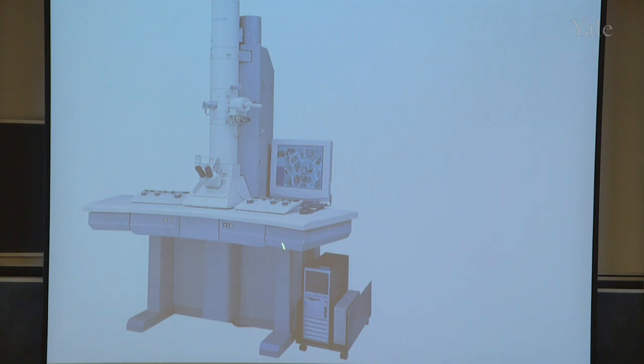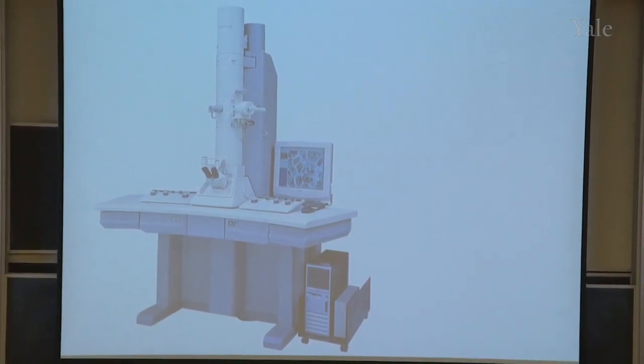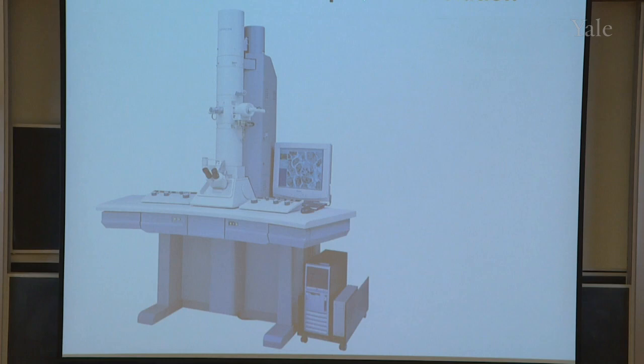It's a very big machine. So here's a computer screen as a sort of reference point. And using this, you can see things at a 1 angstrom resolution. What is 1 angstrom resolution?